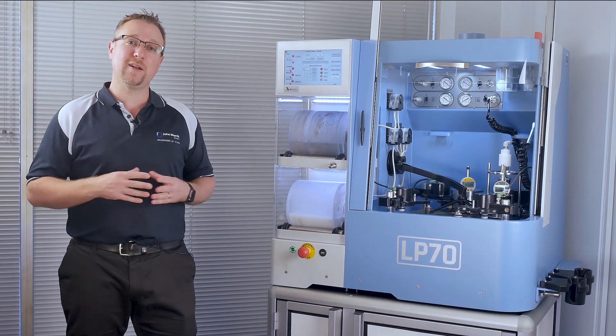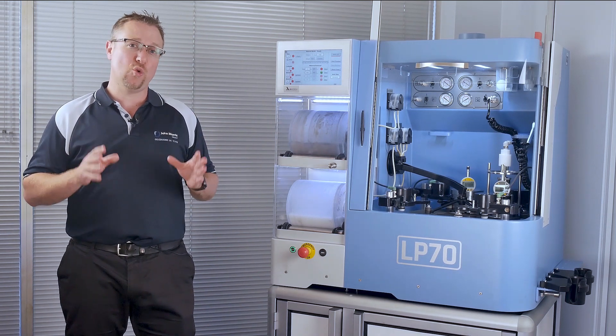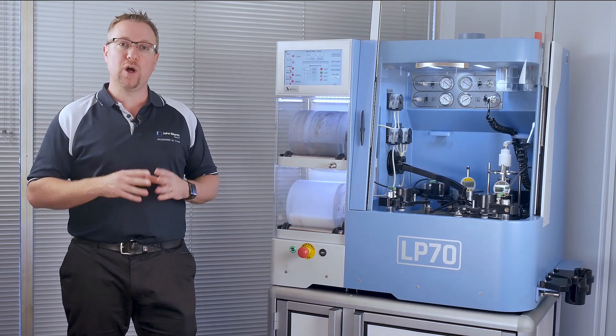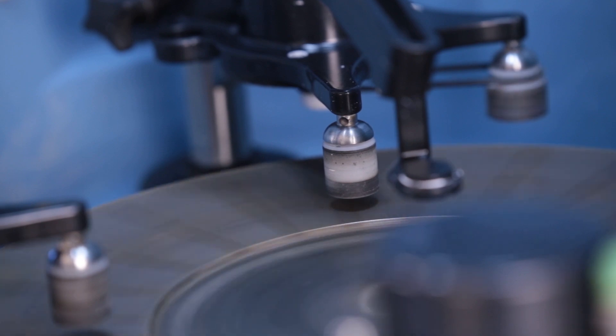Also, if you're a semiconductor manufacturer and you need to reduce your wafer thickness, we can provide the most accurate and reproducible results. The process of chemical mechanical lapping and polishing would be used, and this thins and polishes the wafer for packaging of the components and allows for the most efficient conductance of current through the device.